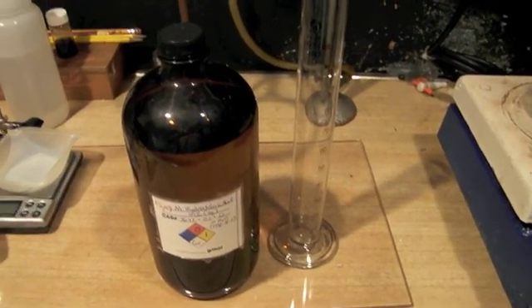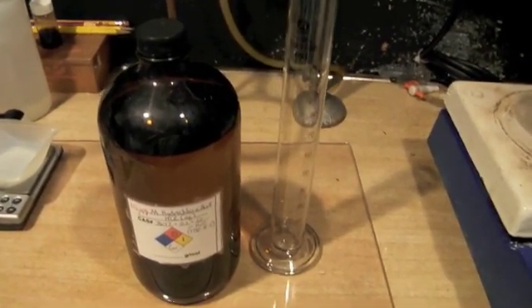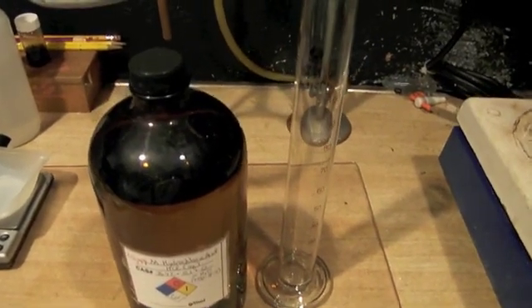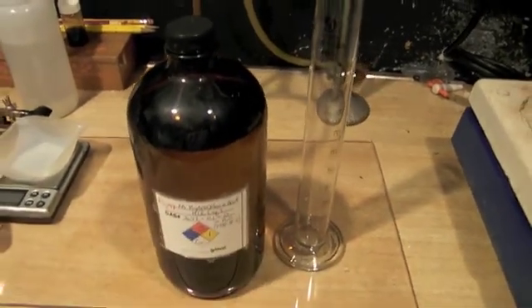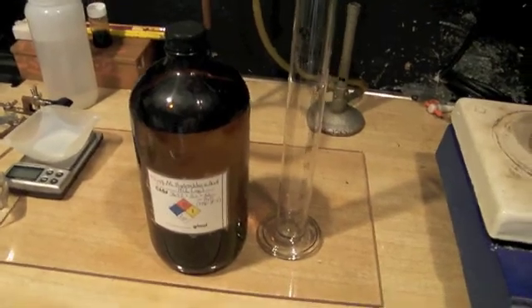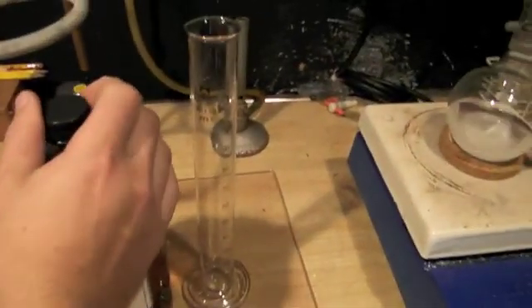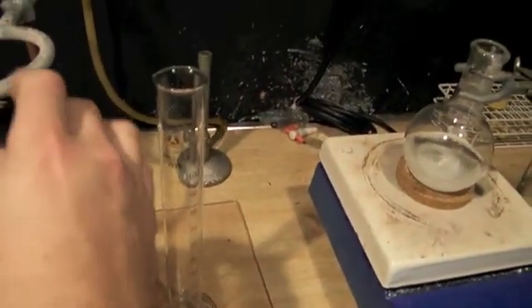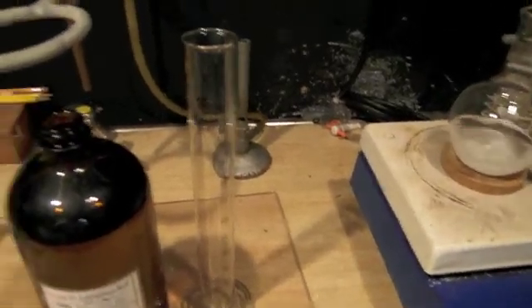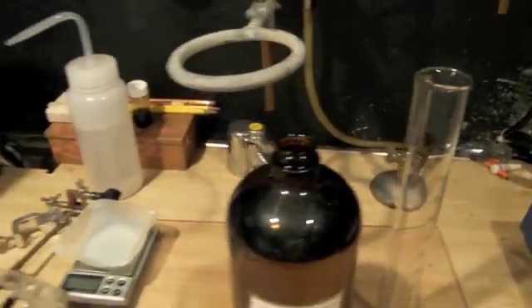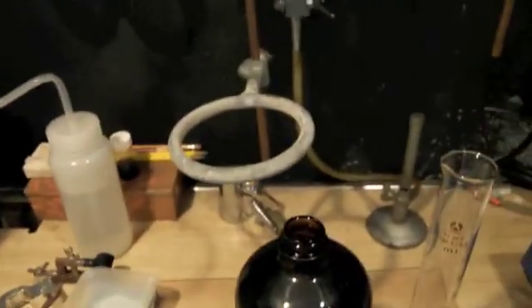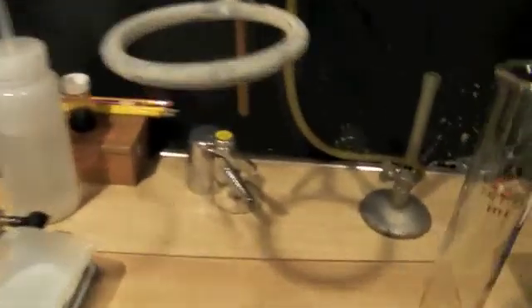The next step is to add a stoichiometric quantity of the hydrochloric acid. I have 10.42 molar hydrochloric acid. You should adjust your quantities accordingly. In this case, I will measure out 40 milliliters of the 10.42 molar hydrochloric acid into this glass graduated cylinder.